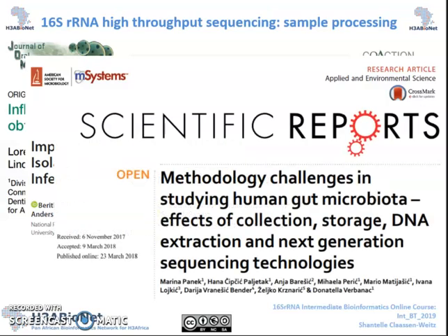For example, some DNA extraction methods are better at extracting DNA from hard-to-lyse gram-positive bacteria. Since bacterial community profiles generated using 16S rRNA gene sequencing are measured in relative abundances, which means that the data is compositional and adds up to 1, a reduced abundance of one organism will result in an increased abundance of another. Hence, bacterial profiles from the same sample may differ when using different DNA extraction kits.